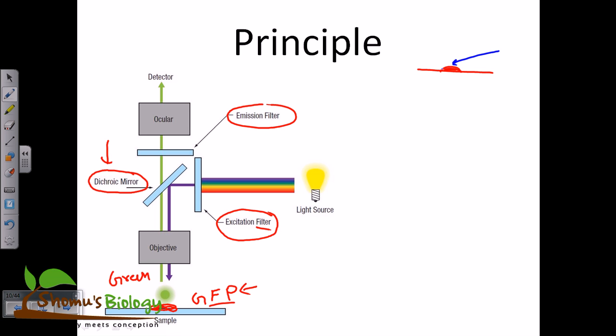As we are looking at samples which are three-dimensional, different focus planes, or focal planes, originate. Top, bottom or medium, different focal planes start to originate, and the lights coming from different focal planes will meet in different regions. So this sample can actually scatter light.